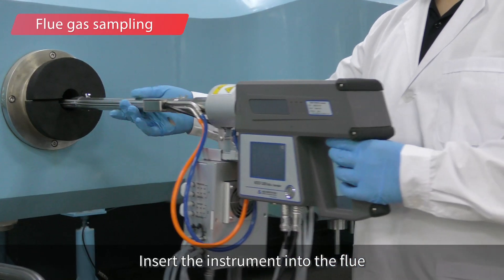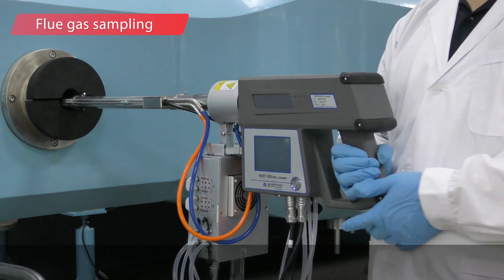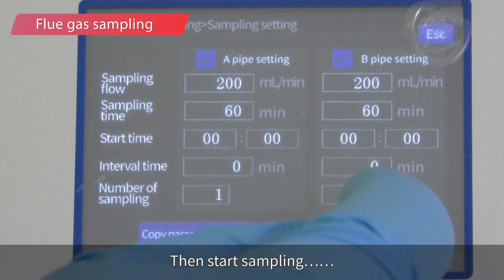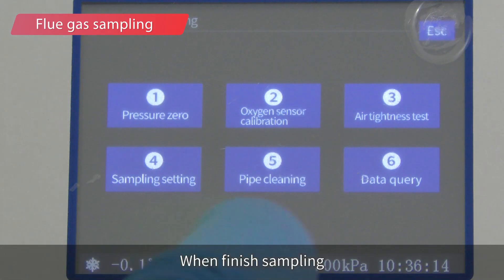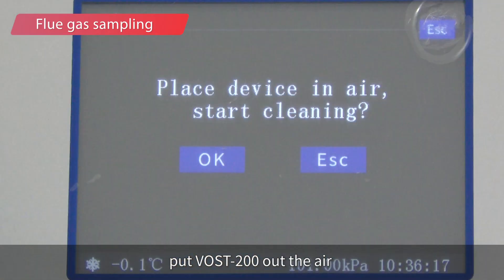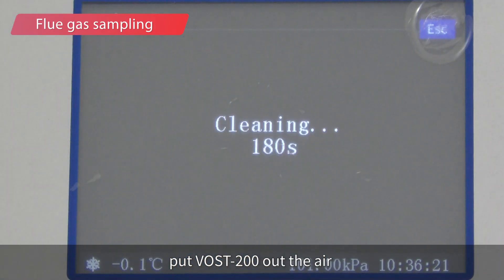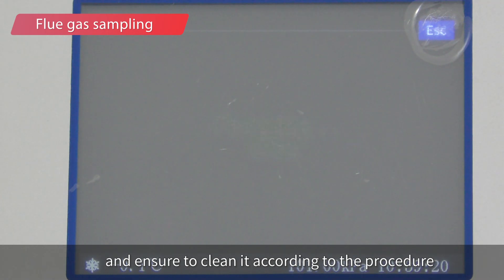Insert the instrument into the flue, then start sampling. When sampling is finished, remove the VOST-200 from the flue into the air and ensure you clean it according to the specified procedure.